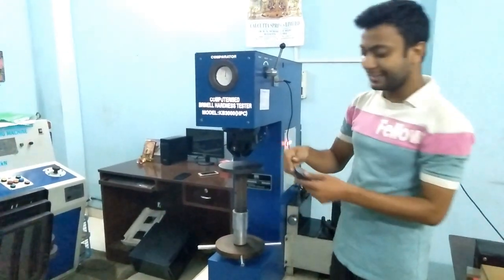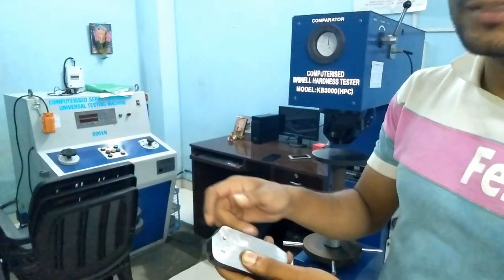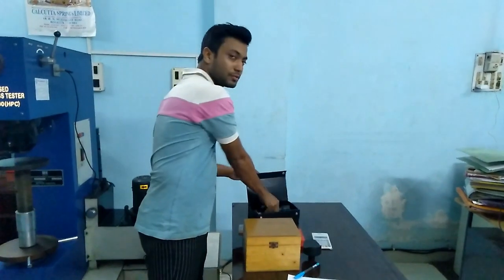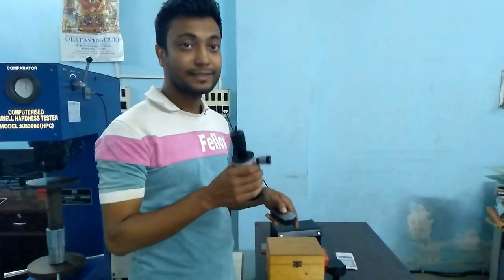You can see the indentation here. Now we have to calculate the hardness — what is the hardness of this sample. For this, we use the microscope. The indentation is here; I am going to measure the indentation size.